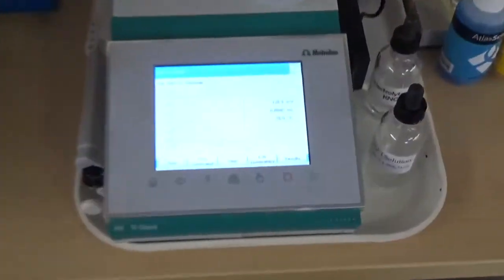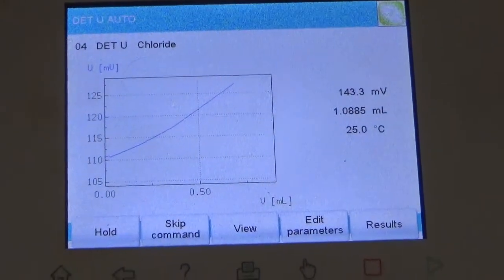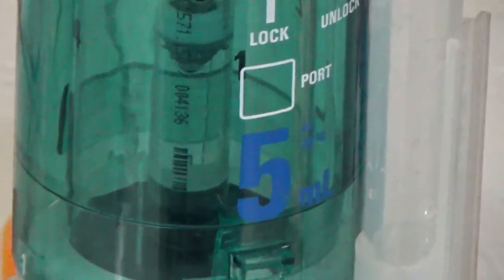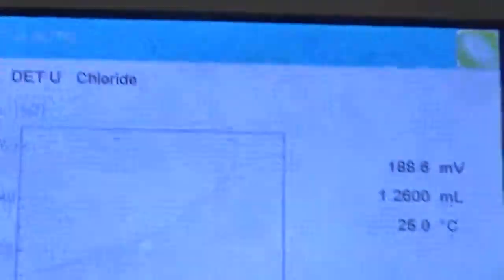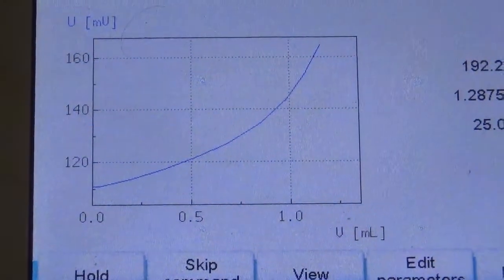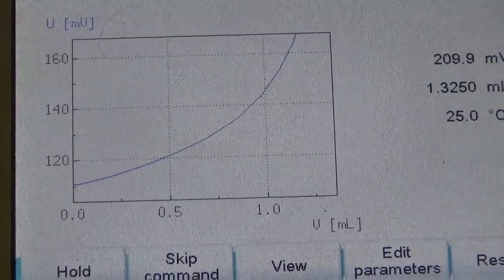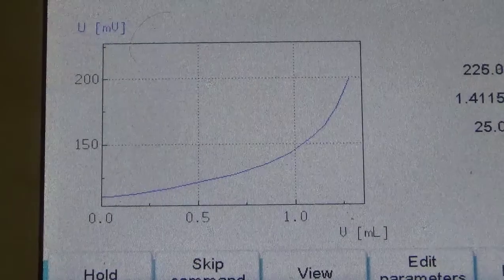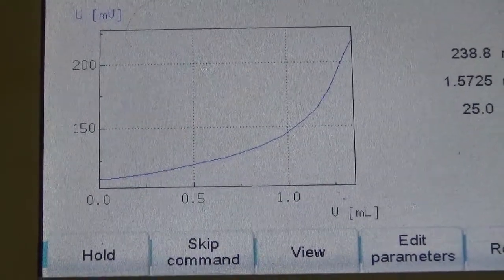Very precise dosing. As the equivalence point approaches, the titration slows down. The steepest point in the plot represents the equivalence point. Once the equivalence point is obtained, chloride content is determined according to the procedures of ASTM C-1152 and C-1218, using the formula: 0.177 times equivalence point divided by sample weight.